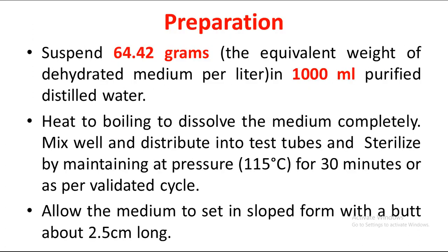If we come to the preparation of it, the preparation is very easy, and it is known to most microbiology students. You have to take a specific amount of media and dissolve it in a specific amount of water. If you want to take 1 liter of water, you have to dissolve 64.42 grams of the TSI media. If you want to decrease the amount of water, there is a specific formula for that. You just have to divide and multiply to get the actual amount, and I'm pretty sure that you know about it.